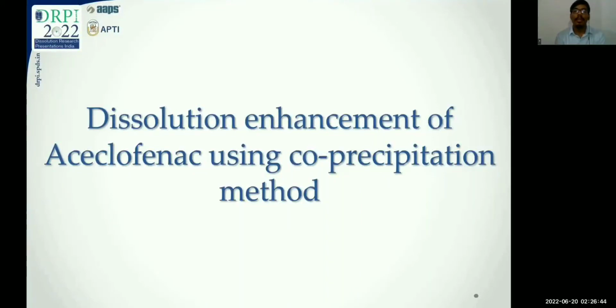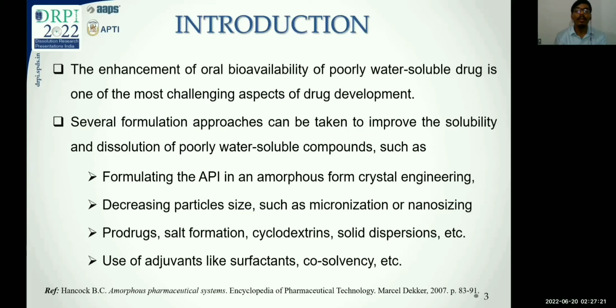Hello everyone. I'm here to present on dissolution enhancement of aceclofenac using co-precipitation method. Aceclofenac is an NSAID drug that is used to relieve pain and inflammation. It is a BCS class 2 drug which has poor aqueous solubility.